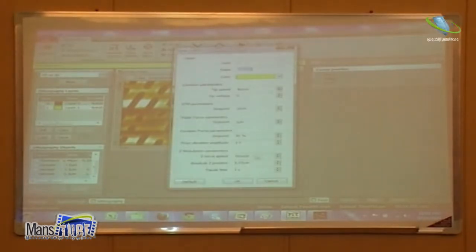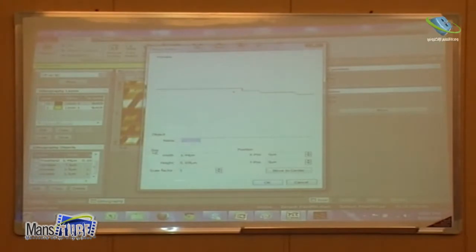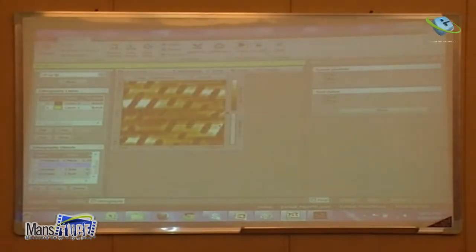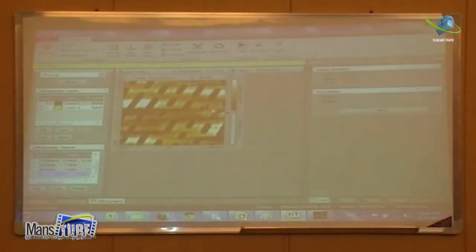Here. This is the layer. 1 micron. Okay. This is, let's say, the freehand one. The position is down here. This one is the big one. Okay. Yeah. I mean, I will take this one. I mean, we need this one. Okay. Yeah, this one. So I take this one. So this is the 2. Then I make position 3.4 micron, 0.4 micron, and the Y position is 0. Okay. Oh, it's minus then.